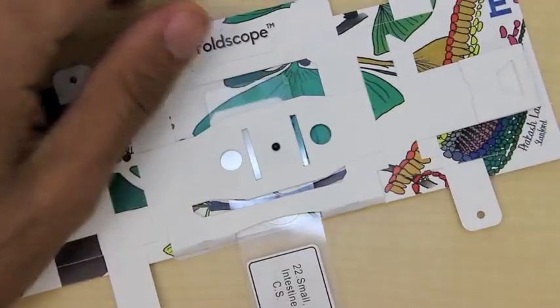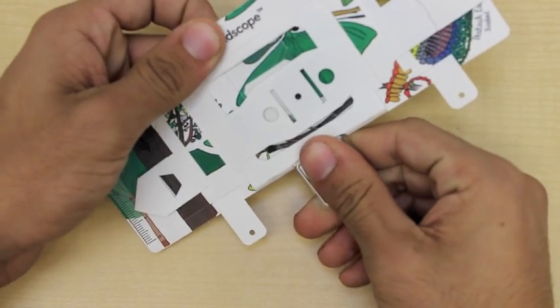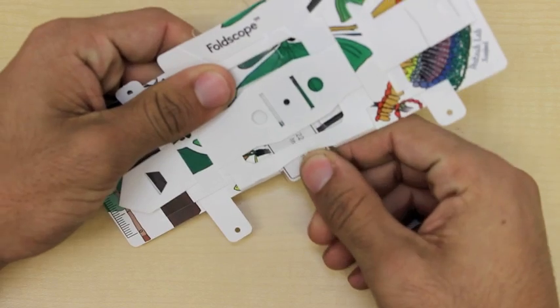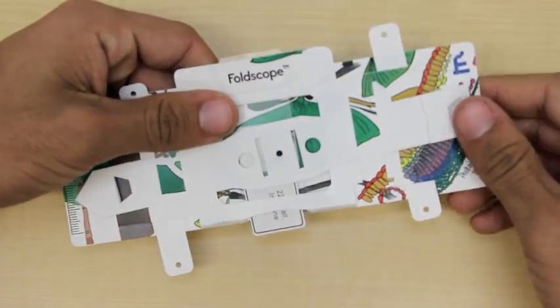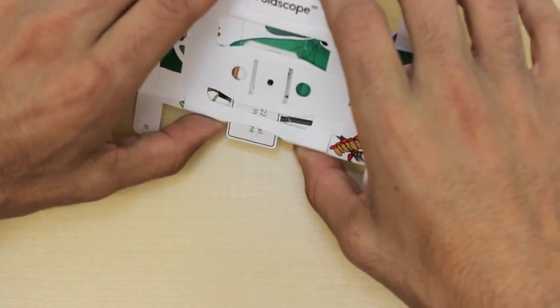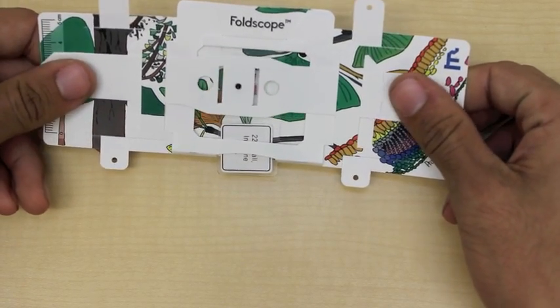This part may be difficult the first time, but should get easier over time as the slit loosens. Push it through the slit and continue until the sample is in the center of the slide stage, such that you can easily navigate it with the lens.